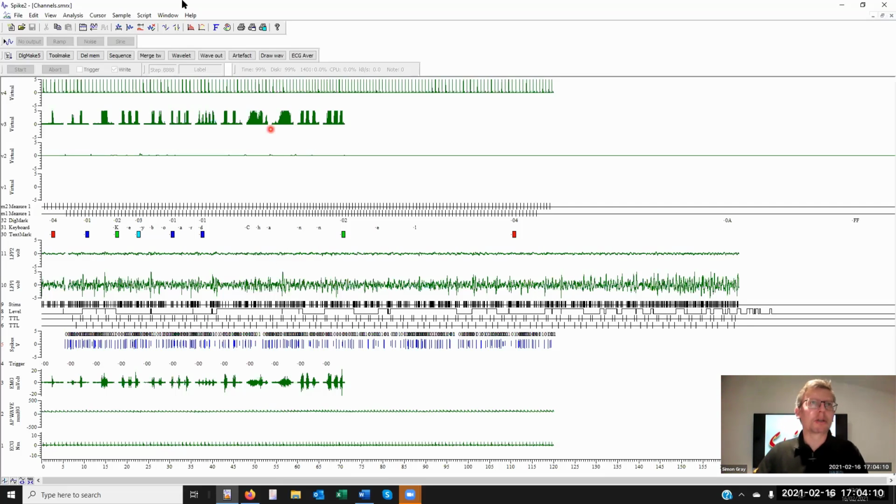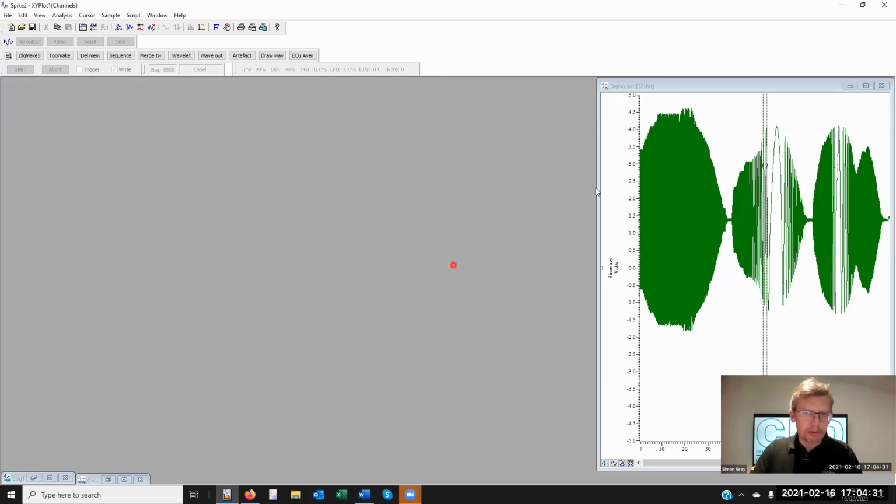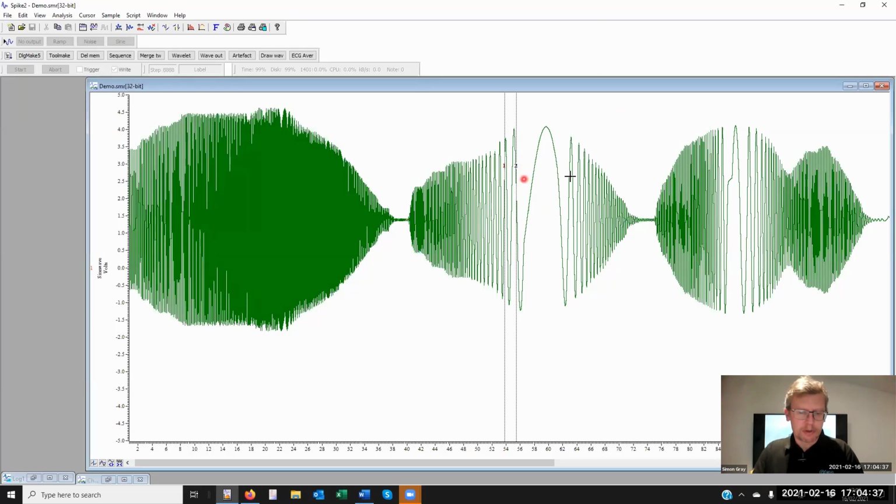Okay, now a couple of other things I wanted to get through, and that is to mention more of the XY views. Okay, so we have looked at, I'm annoyed at that, the XY plot not working. Let's just try that again. Maybe it was the wrong window.